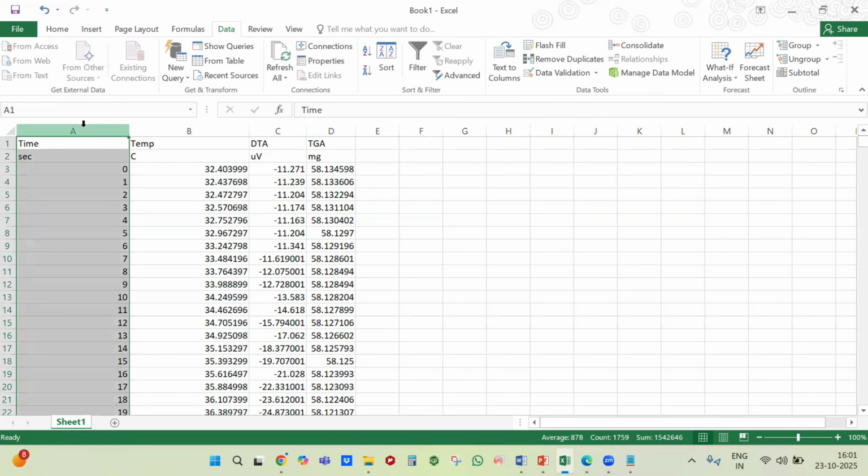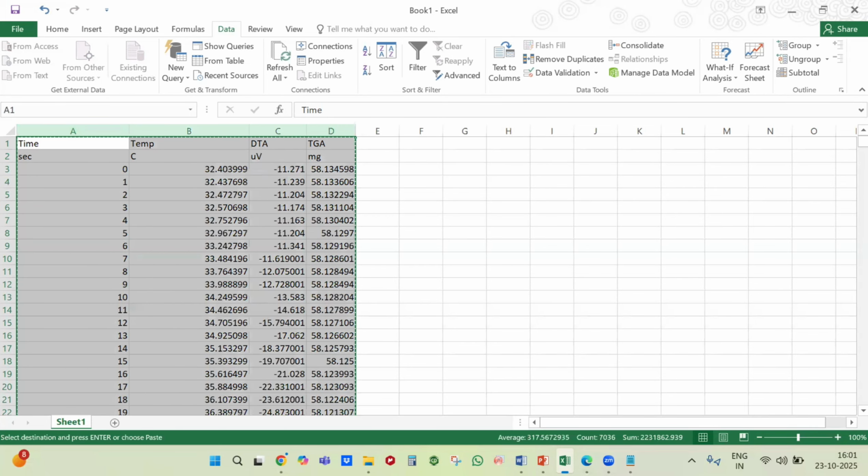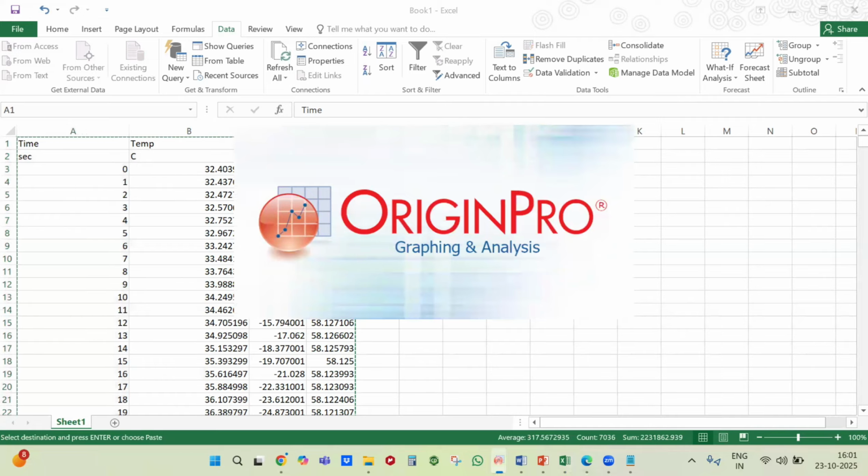Okay. Now I will select all, Control C. I will open my Origin Pro Lab software.